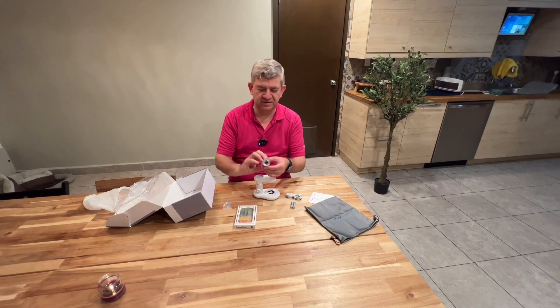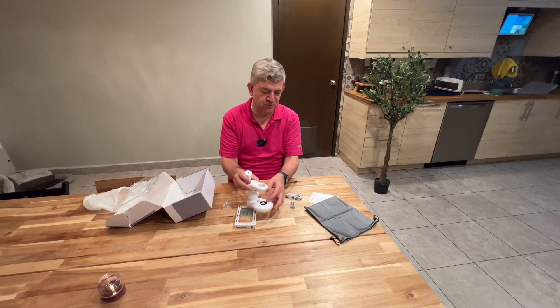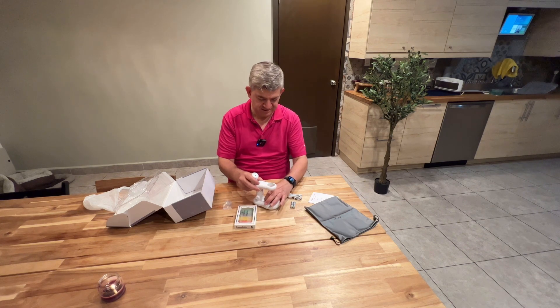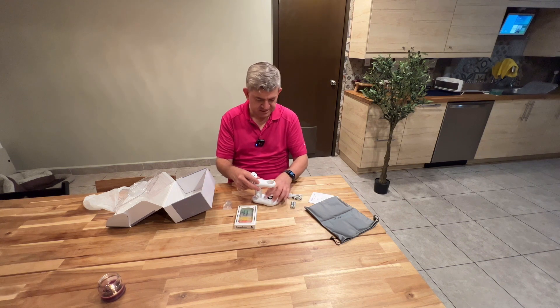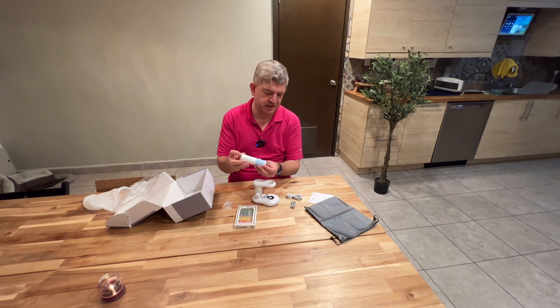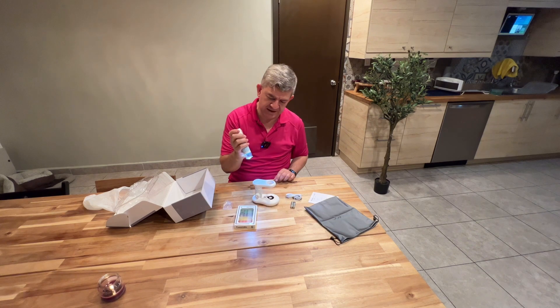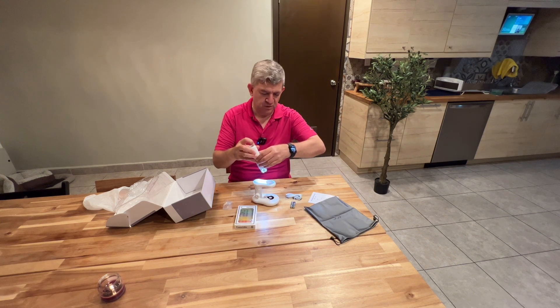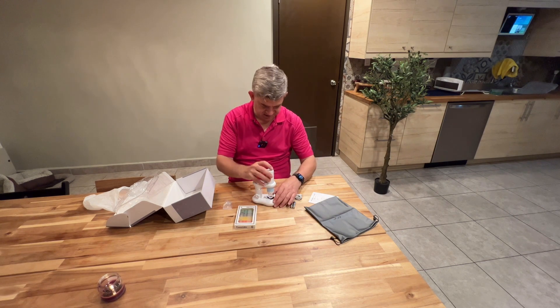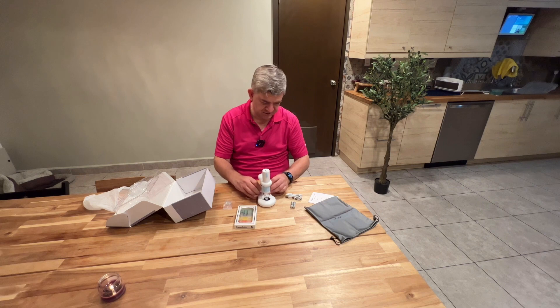This is the actual microscope. This piece will help you to get the slides or trays in place so they don't fall apart. It's magnetic, so it's easy to move. It's charged, as you can see. You can have more light or less light. We are going to put it up and down to fine-tune your view.